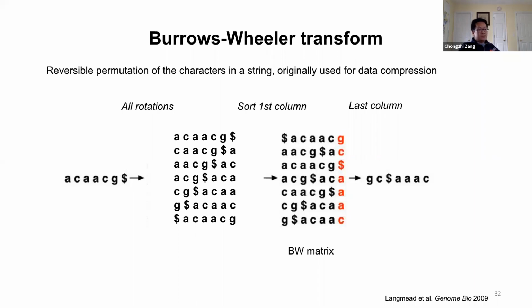The names of both have a B and a W. They refer to the Burrows-Wheeler transform, an efficient algorithm to process and index the genome, so that read mapping is extremely faster than comparing each of the tens or hundreds of millions of reads against the 3 billion base pair genome.